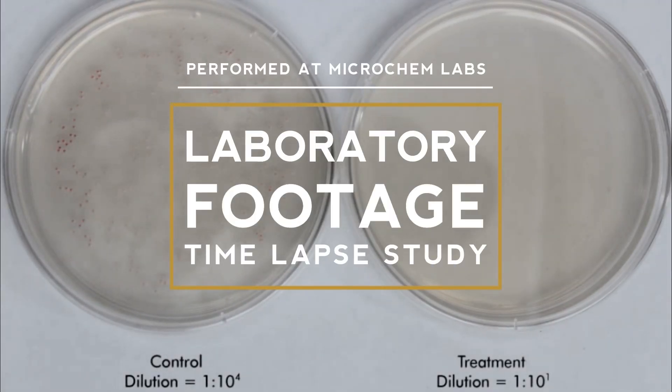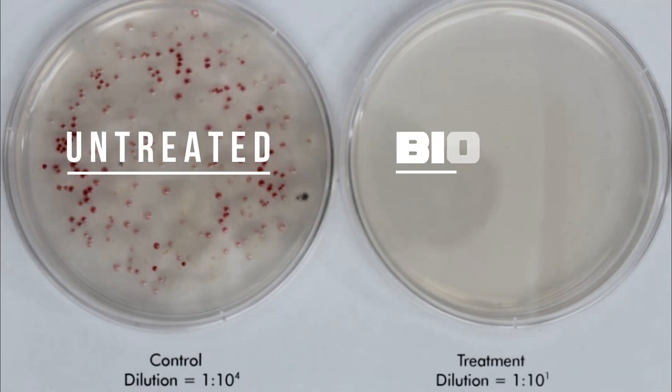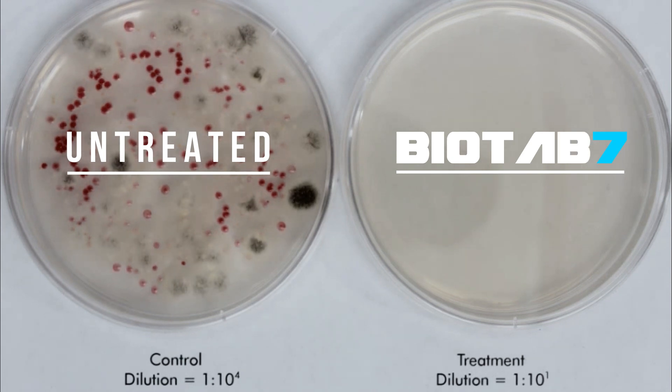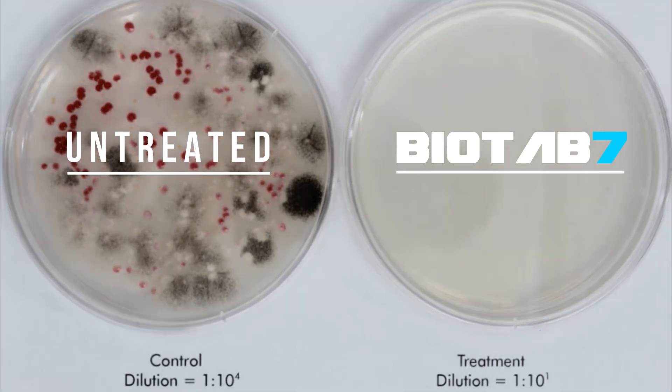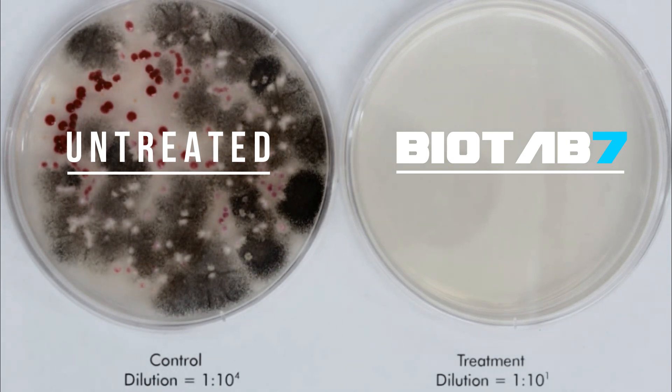So here we have the results in real time — this is the lab filming it for us. The dish on the left-hand side is untreated; the dish on the right-hand side is treated with Bio Tab 7. As you can see, the bacteria are thriving on the left-hand side, but there's not a trace of them on the right.